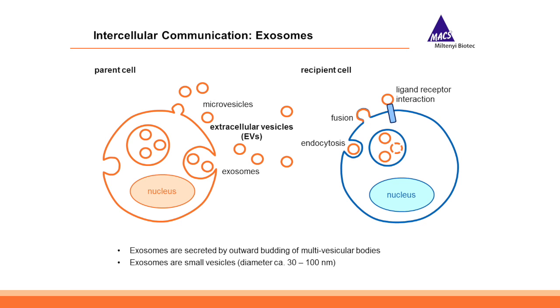So exosomes are defined by the release mechanism by the cells. They are secreted by outward budding of multivesicular bodies, and these are small vesicles about 30 to 100 nanometers large. The release mechanism is different from microvesicles, which are generated by just outward budding of the membrane.